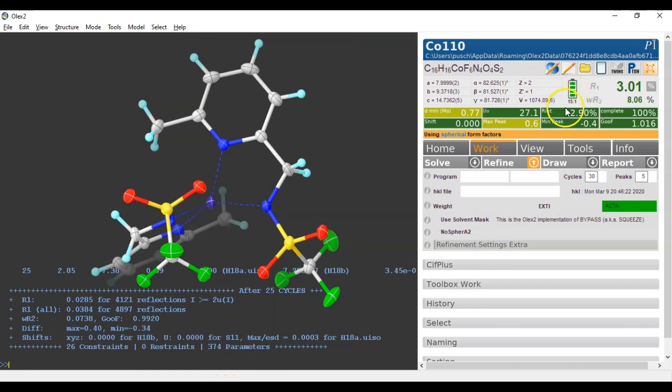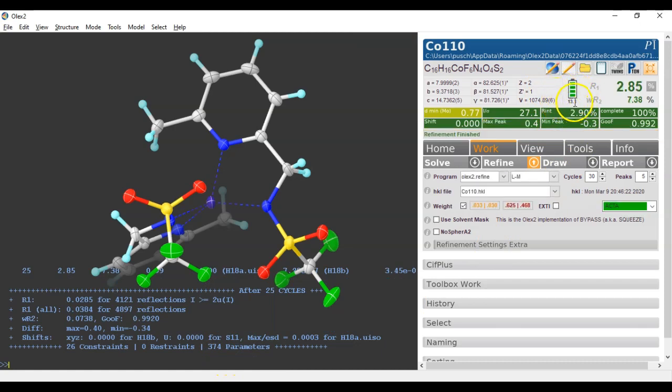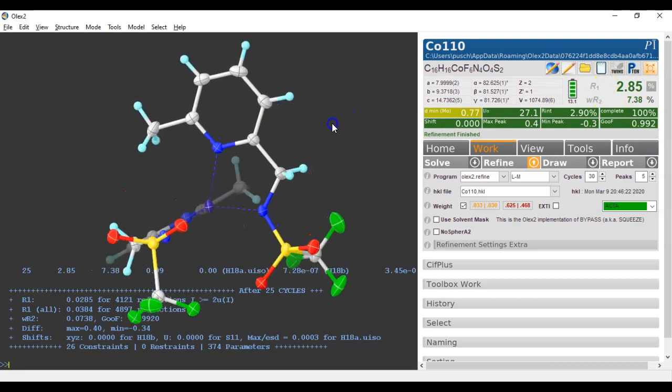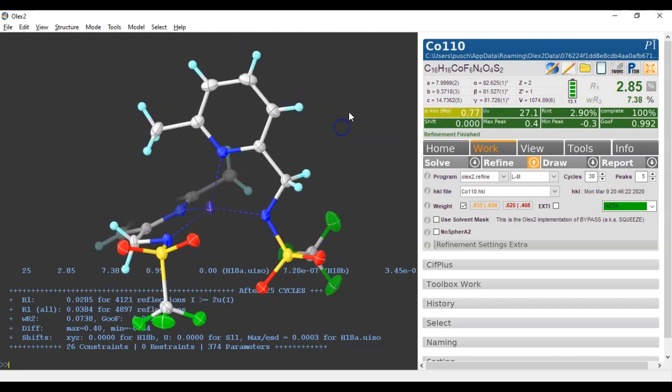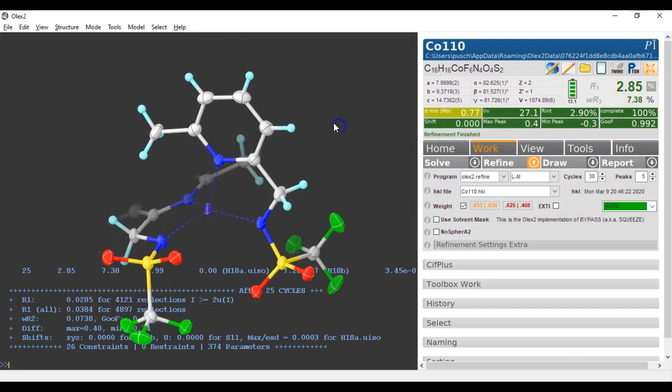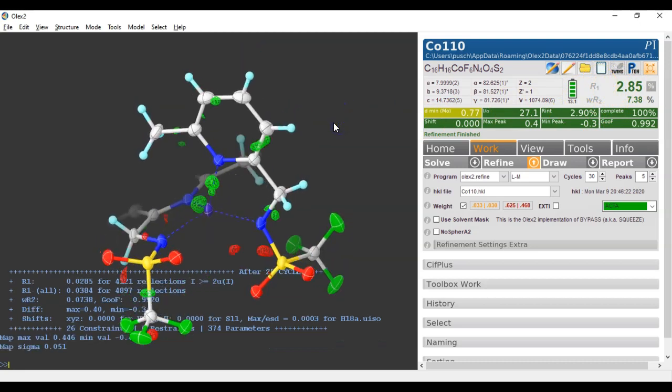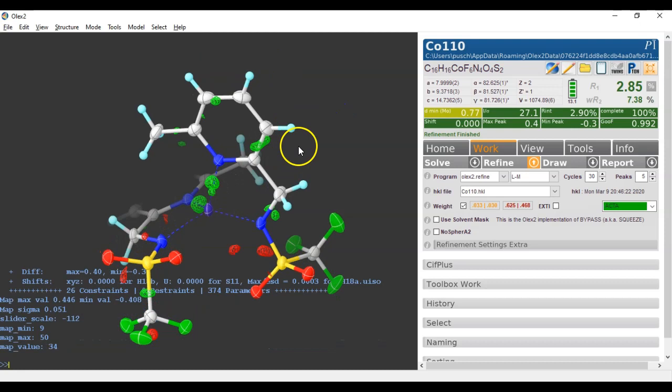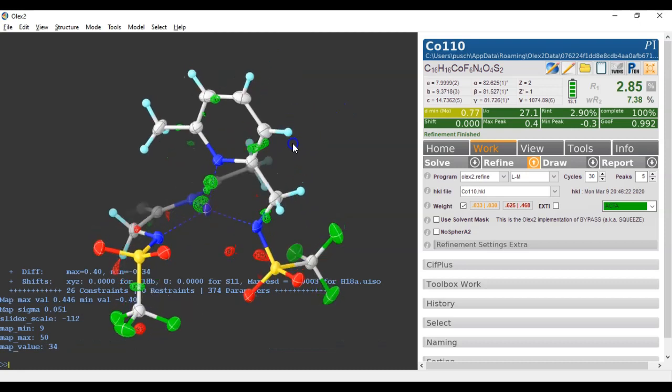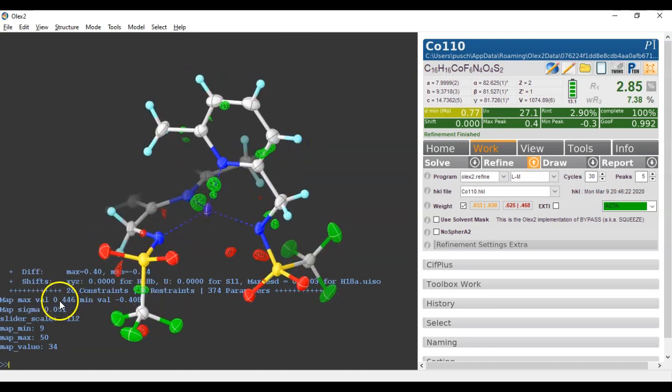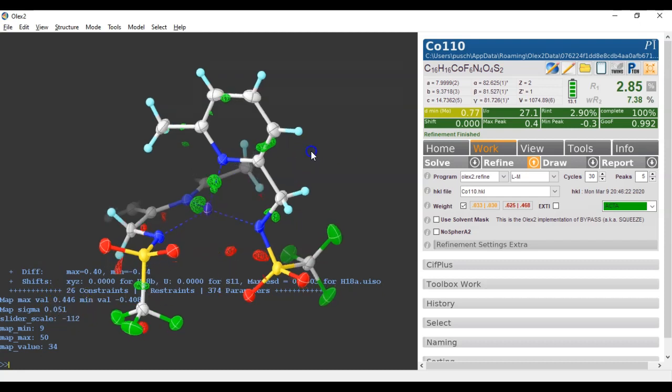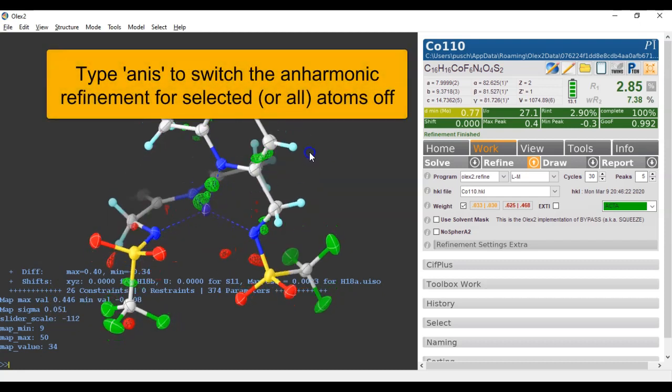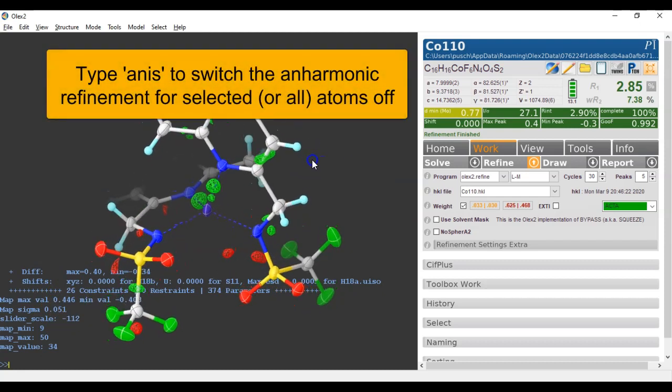Now the parameter will be about 13 data-to-parameter ratio. The final R-factor is 2.85%. So it was 3.2%. CTRL-M, the map is very much cleaner. And also the maximum value now is 0.44. It was about 0.7, 0.65 in the standard refinement.